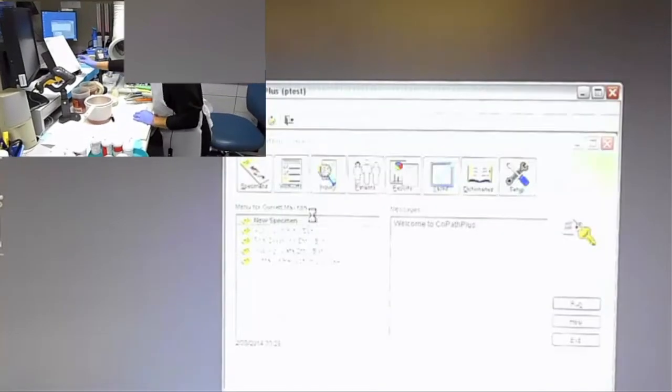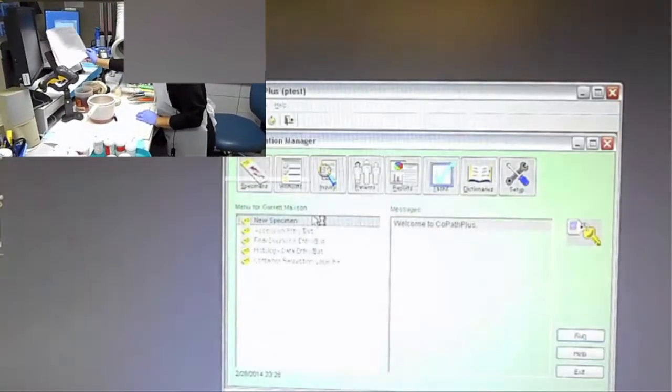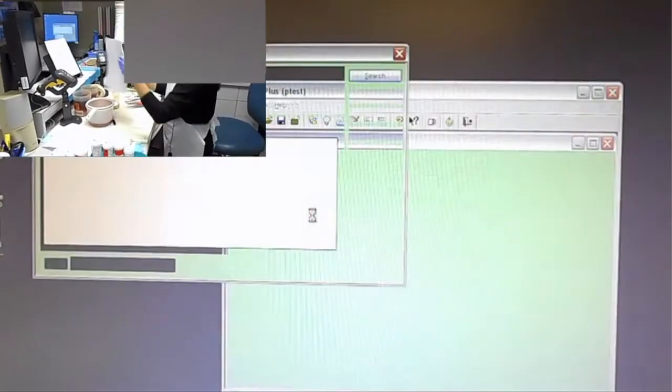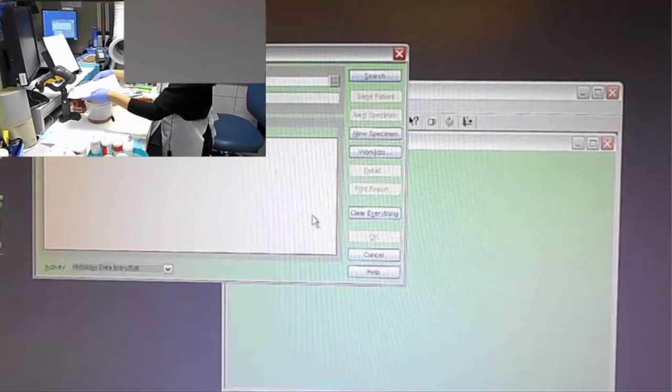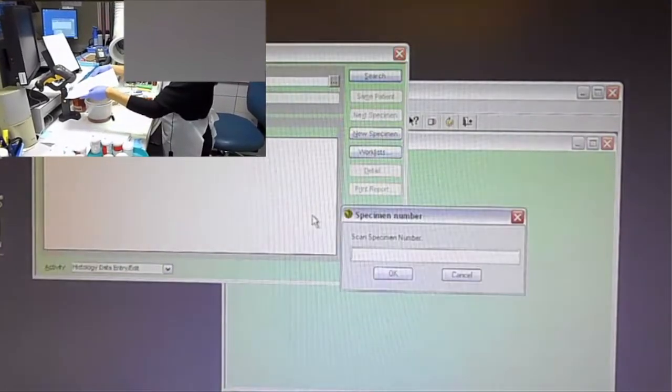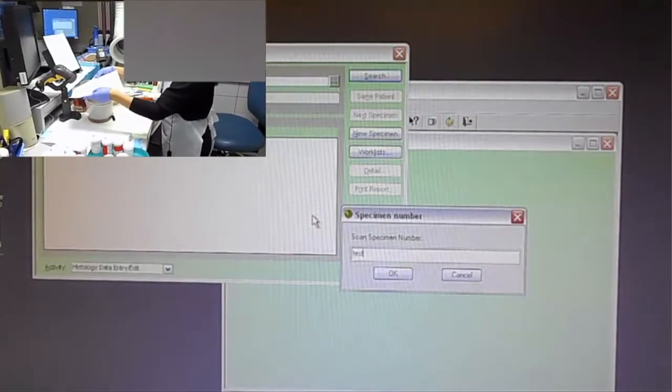You're going to see that I'm not clicking anything on the main screen on CoPath, and what it's going to do is bring me into histology data entry automatically, and then she'll be able to scan with the left scanner the barcode into CoPath, and then right into Word will go into the case. So through that, I'll guide you through what's happening exactly when she does have it scanned.